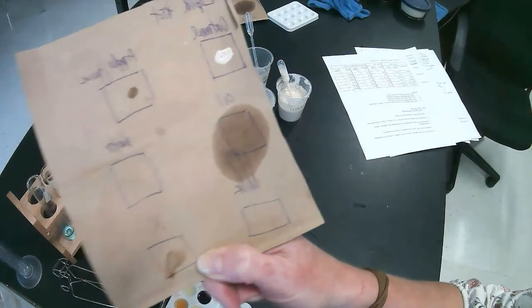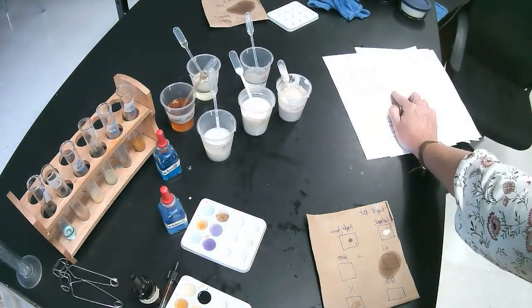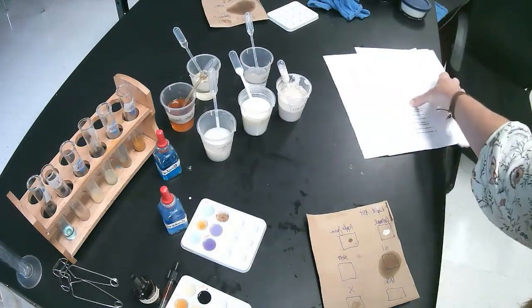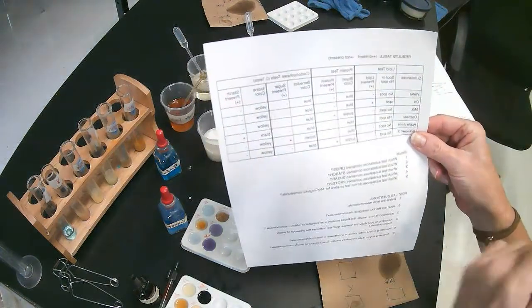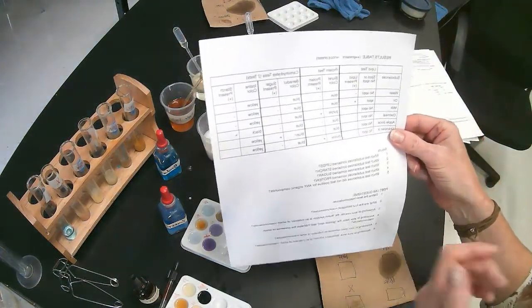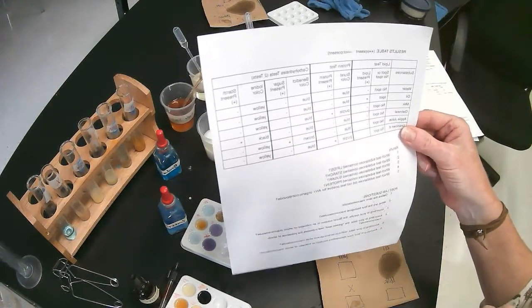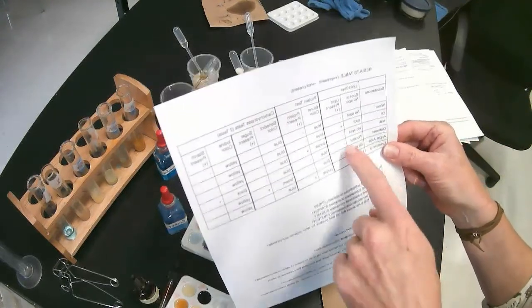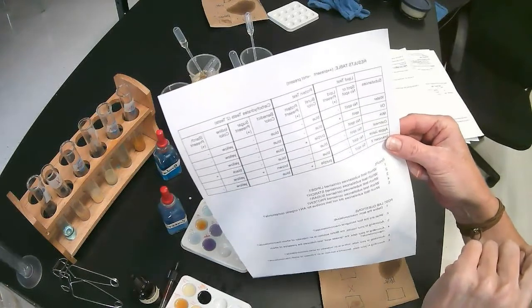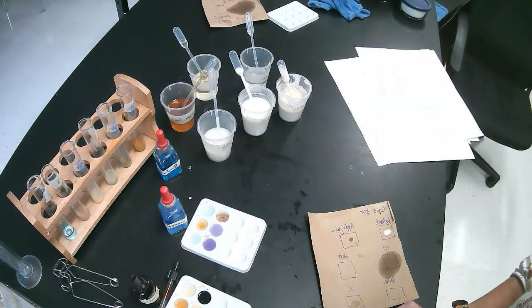Okay, so when you're looking at the results table on your worksheet, you'll see that in the lipid test, it already has the results for you. So, why am I watching this video? Trust me, watch this video, because when you take the test for macromolecules next week, you need to know what this all looks like, okay? So again, the only substance that's positive for lipids is the oil, okay? Super duper. Any questions? Email me.